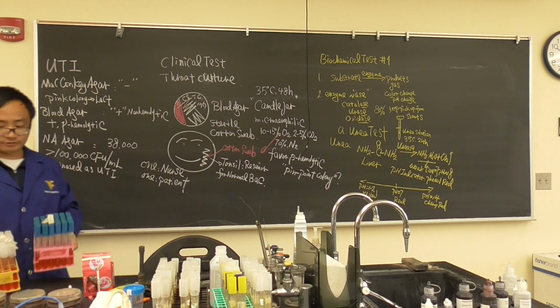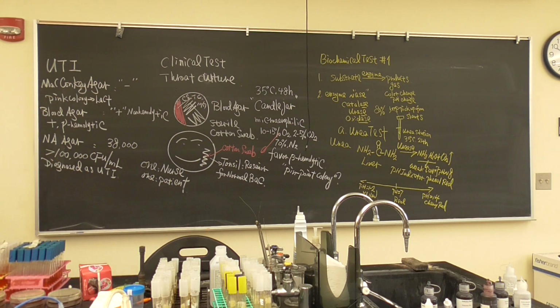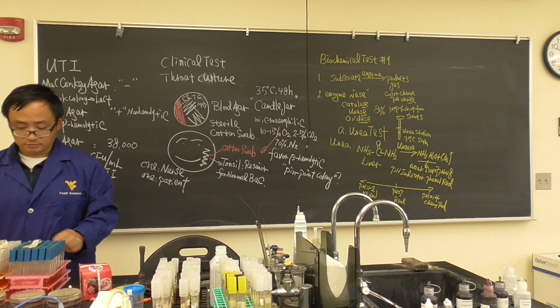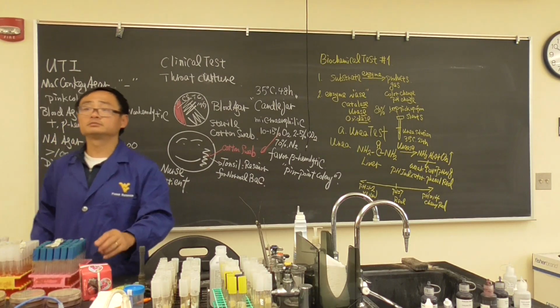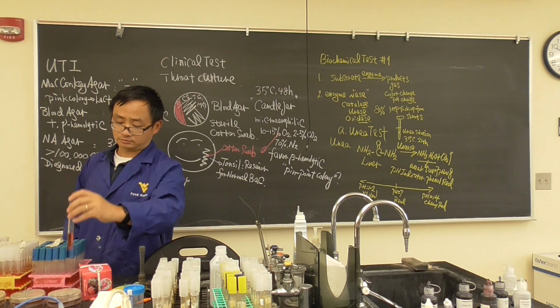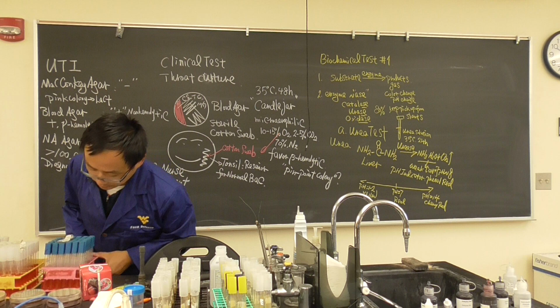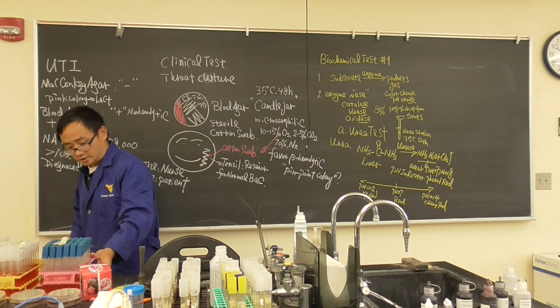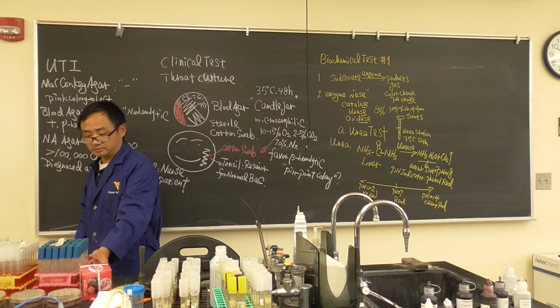This is kind of confusing. We have 3 tubes here. So we want to talk about it. Rayon, can you remind me what are these? What's the blue one? This could be phenol red.